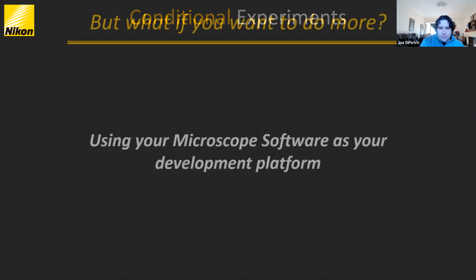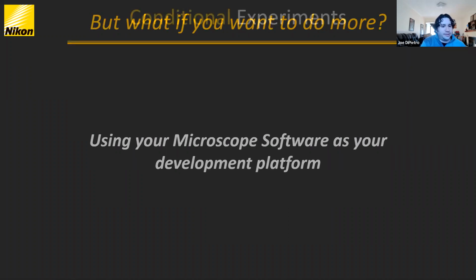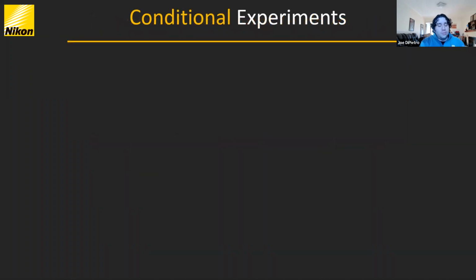So let's discuss some examples of things that you might want to do in this context, right? One of the things that you might want to do is a conditional experiment.